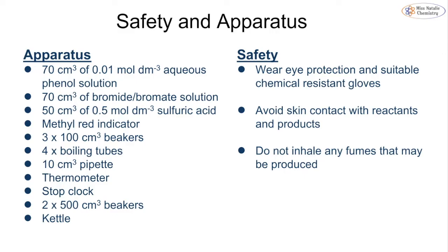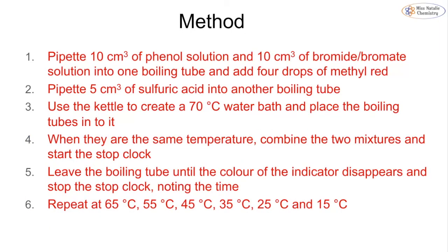Well, we're going to be using a phenol solution, as well as a bromide-bromate solution. We're going to need some sulfuric acid and methyl red indicator, as well as beakers, boiling tubes, pipettes, thermometers, and stop clocks. Safety as normal: wearing eye protection and suitable chemical resistant gloves, and making sure that we don't inhale any fumes that might be produced.